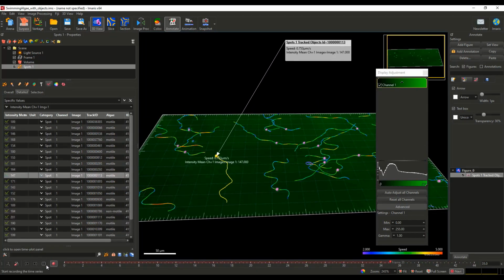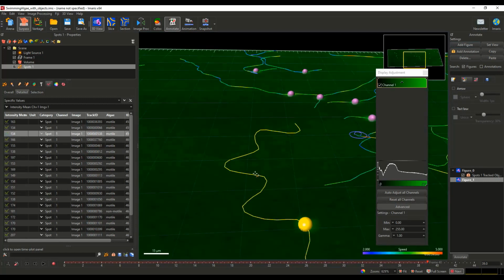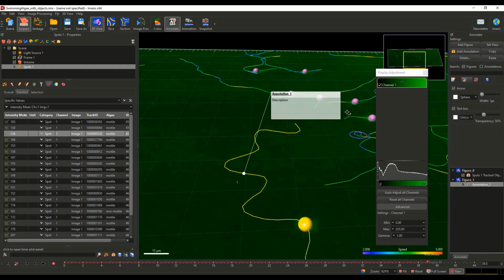Okay, so I just wanted to end on this because it allows you really to add as well some statistical values to it, but the annotation tool is also meant to add just text. I will show you that eventually here. It's only 3 clicks, so 1, okay, add annotation. I need to add an annotation. 1, 2, 3 clicks, you get a box, but this box will be static.